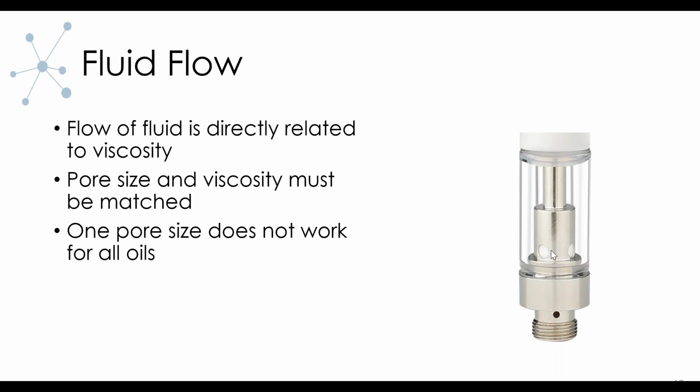What that will do is cause the viscosity of the cannabis oil to decrease. And so when you're formulating your cannabis oil, understanding the pore size and how that will impact your oil is very important. Again, without doing the analysis of your cannabis oil and understanding how your oil is changing with the shearing impact, this will have a big influence on the vaporization of the oil as well as leaks.